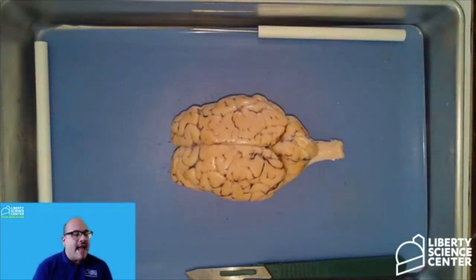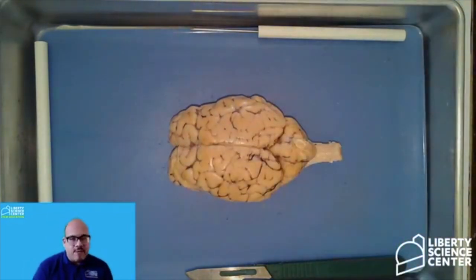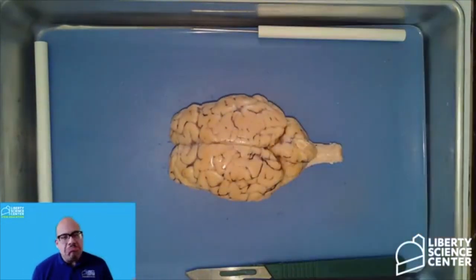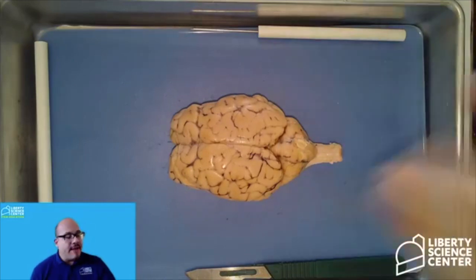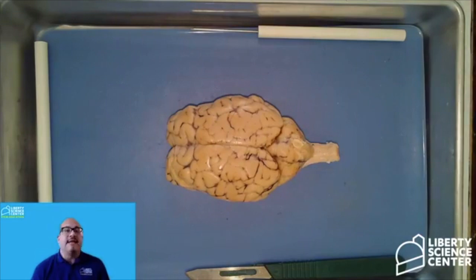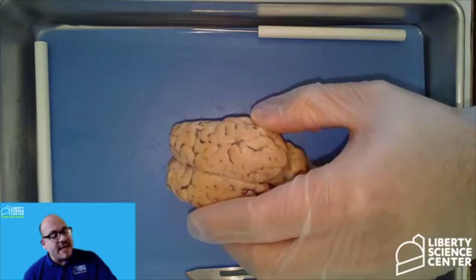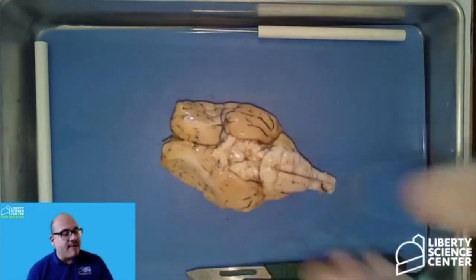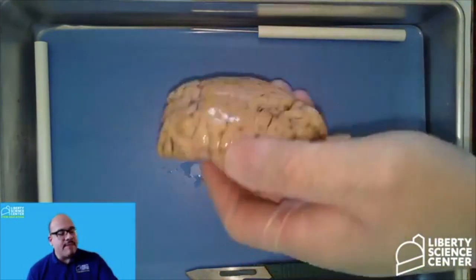Welcome, welcome. And so the average weight of a sheep brain is actually less than a pound, I would say. It's not that large at all. I think, if I'm not mistaken, it's about 140 grams. Okay, so even smaller than that. But this is the same idea in terms of how the human brain looks. If you're wondering what the mass of an adult-sized human brain is, it's about 3 pounds. All right, so we're going to look at all the external anatomy. So I'm just giving you a nice 360 view, the top and the bottom.